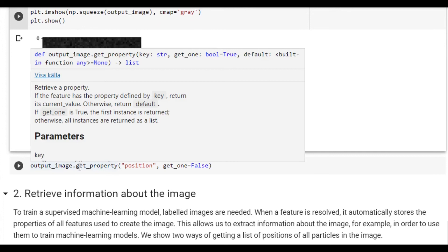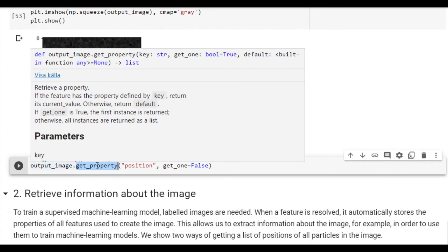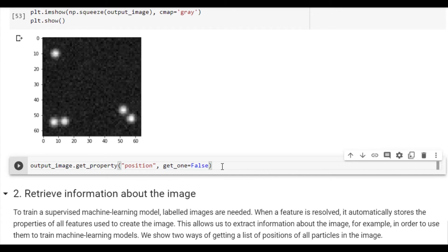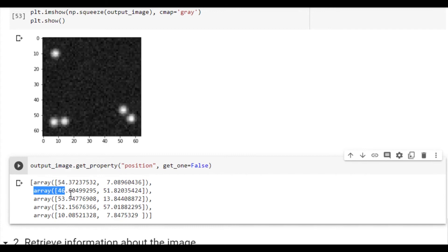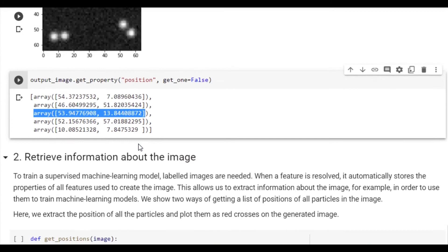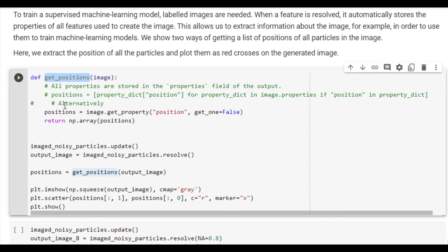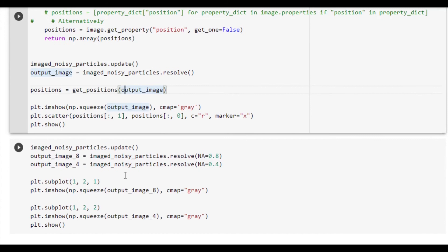We can now use what we've learned about how arguments or properties are imprinted on the resulting image. We can call outputImage.getProperty with a key position and that we want more than one. In this way, we get a list of the positions of all particles in the image. Let's quickly double check that these values correlate to the in-image positions of the particles that we see. We'll define a function that returns the in-image positions of the particles in the manner that we just described. We'll remember to update the feature, we'll then resolve it, extract the positions, show the results and scatter the positions. The red crosses correlate perfectly with the particles' positions.